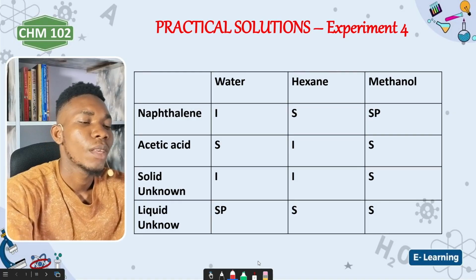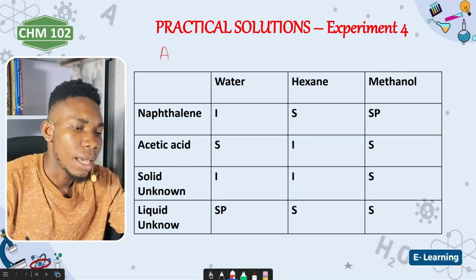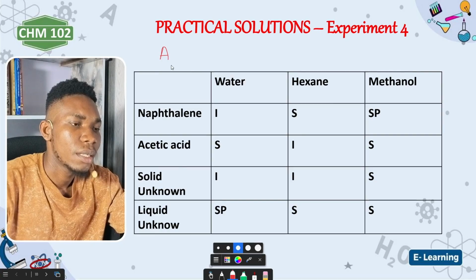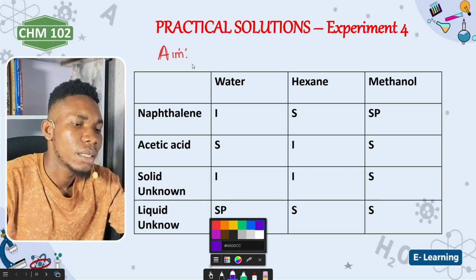Is that okay? So the first practical, the aim of the first practical, we said earlier, is to check for the solubility. Are you getting it?